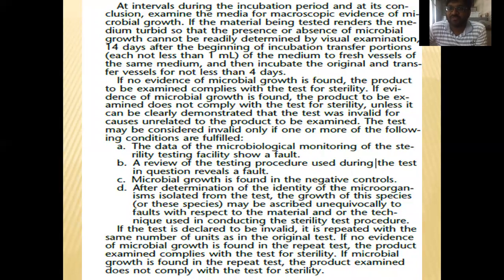And there are many investigations during the sterility testing. If your product fails in sterility testing, the analysts have to do the product sterility testing again and examine it for 14 days. If in the next 14 days your product is not able to comply with sterility testing, then they have to do the investigation with the pathway of the testing using the SOP. The reviewer will see the testing of the analyst. These are the rules and regulations, and these are the steps of the SOP if failure occurs.